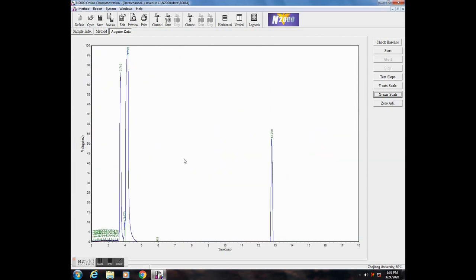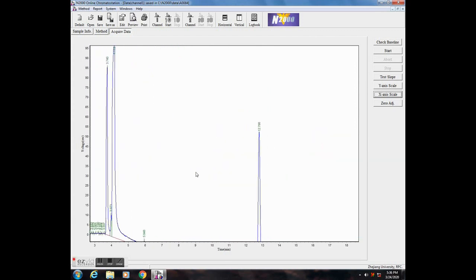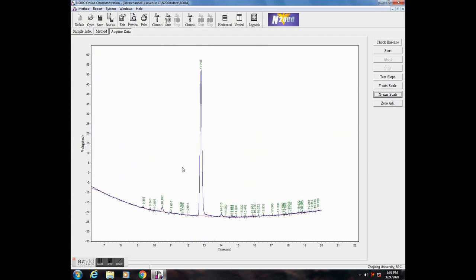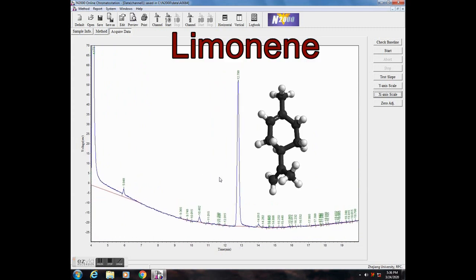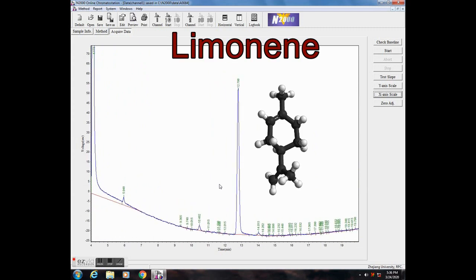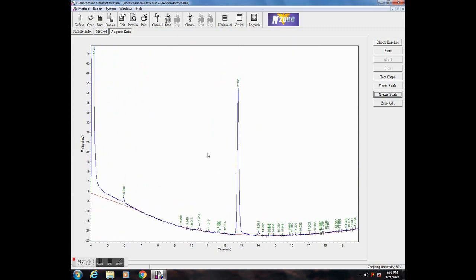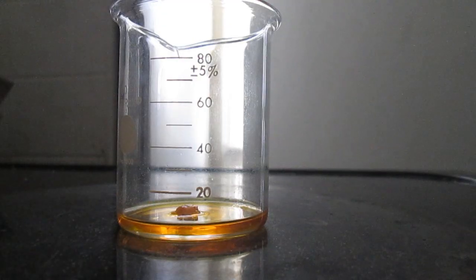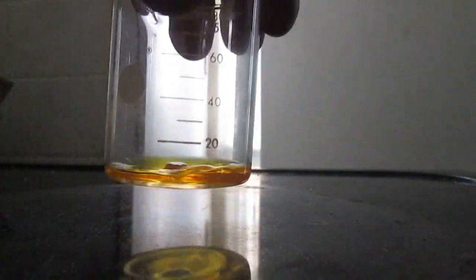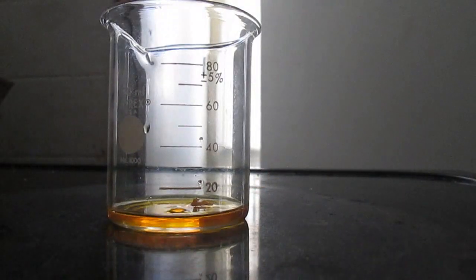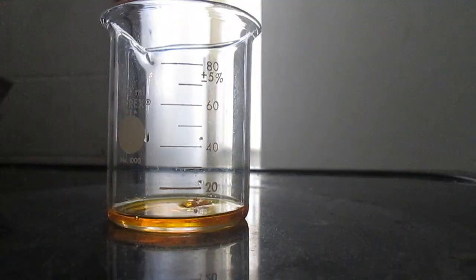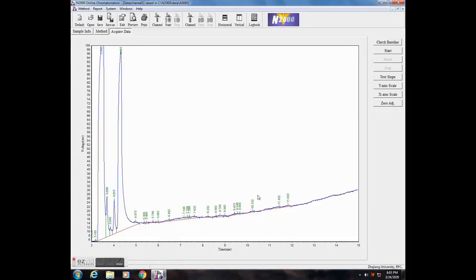These smaller ones I suspect to be esters, and this large one I have reason to believe could be limonene. But again, without a standard, there's no way to be absolutely sure. Just to be sure I wasn't missing any heavier compounds, I concentrated my extract and ran it at 260 degrees, but nothing else really showed up.